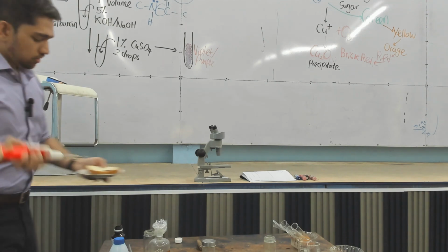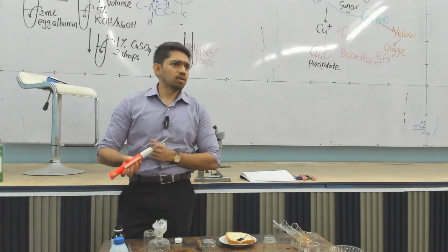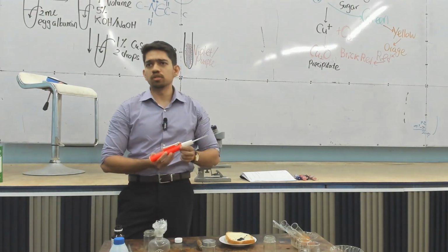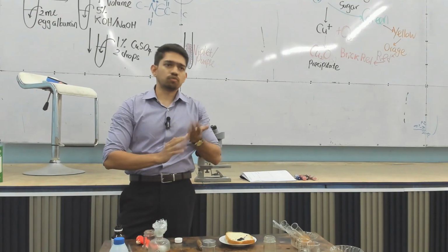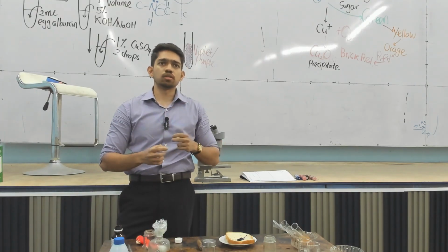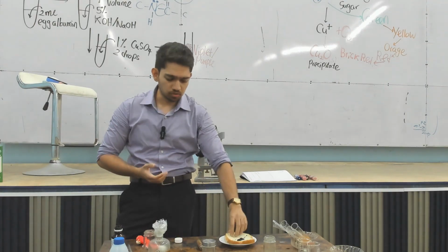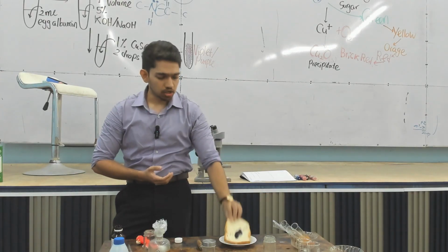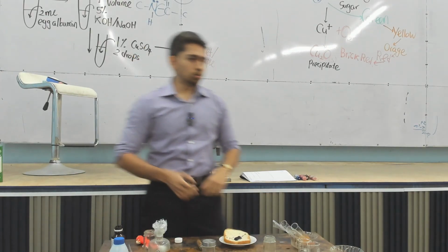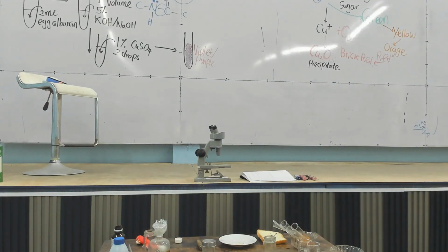So this white refined bread is mainly starch, no? White bread has nothing else, no vitamins. If you take brown bread, you have other vitamins and things, and a bit of fiber. But if you take a piece of white bread like this, it is completely starch. Then we can do this for some pure starch as well.